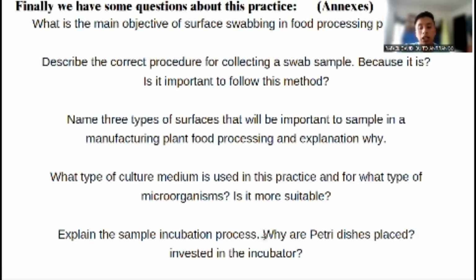Always, this is necessary to implement in the laboratory, and especially on the Petri boxes. And this method is so important because it warrants the precise and representative sample collected, for comparison of results and growing of the microorganisms and pathogens. Something fundamental in the detection of pathogens and contaminants in food production environments.